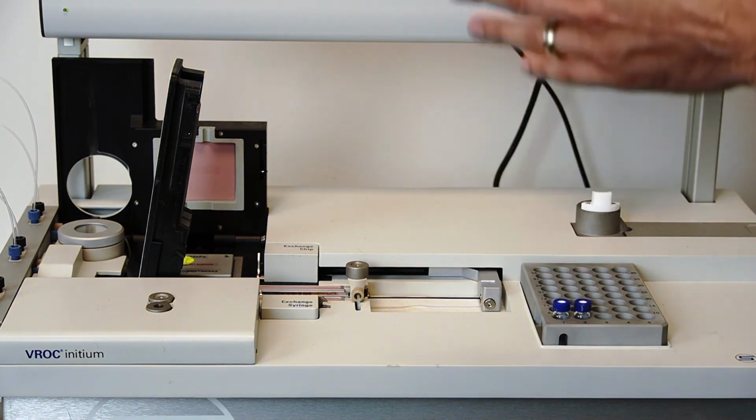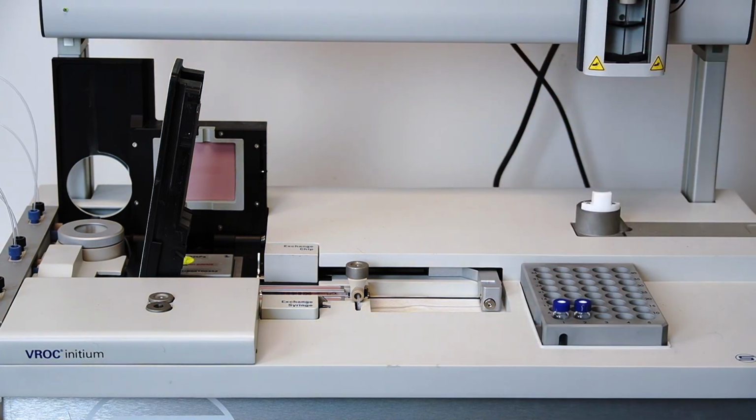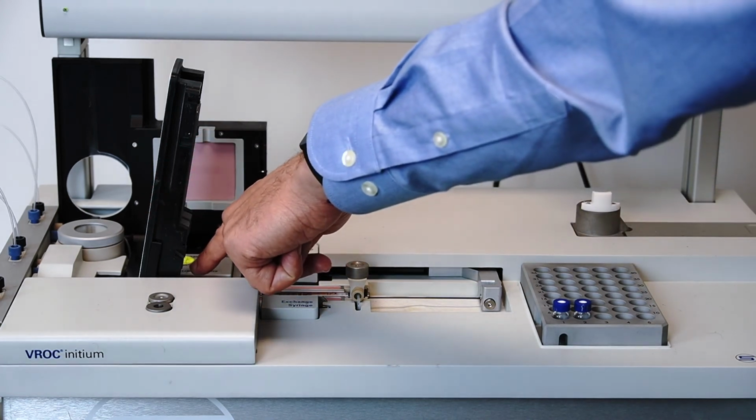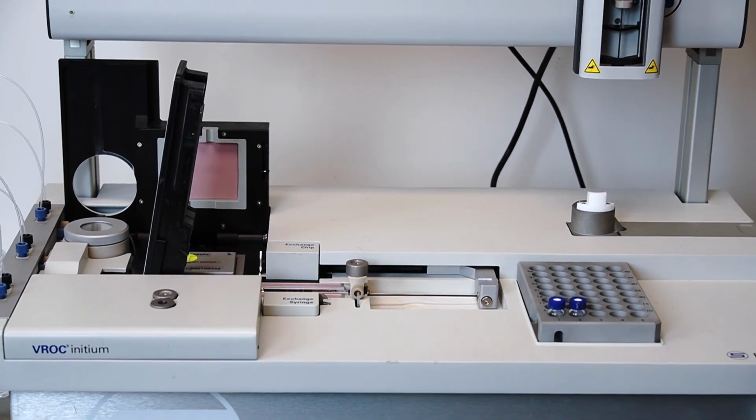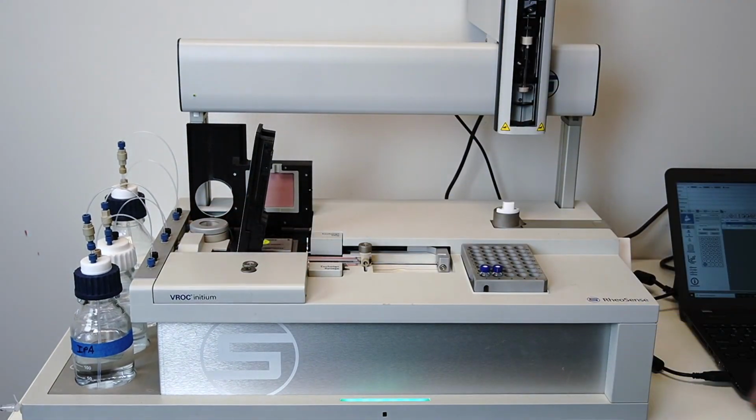So now it passed the syringe pressure test, and so we're now moving on to the flow rate test, and here the instrument is pumping air through the chip to see how the pressure sensors are working. And so it will tell you if the chip is working properly and also tell you if your flow rates are in the correct range. And so now that test is passed, and we're moving on to the final flow test, which is testing the flow in this direction. So once that is all done, the instrument will move on to loading the sample and performing tests.